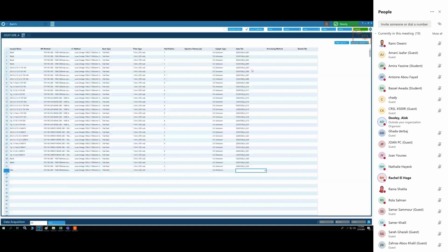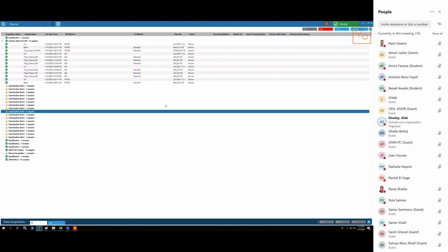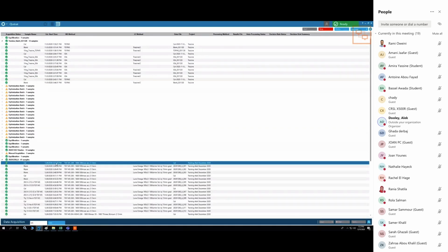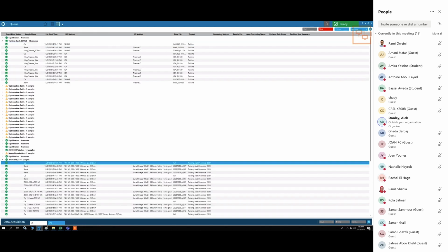Yes. So how long does the calibration take? The calibration takes 2 minutes. Oh, okay. Let's just check that. So we can go to the queue, right? And here are the samples that ran last night. And here's the calibration. What I can do is double click, and here's the data file. And you see, actually, I'm not telling the truth. It's 1.1 minutes, almost 1.5 minutes. 1 minute and 20 something like that. 1 minute, less than that. Yeah, about 1 minute 20 seconds. So not too long.